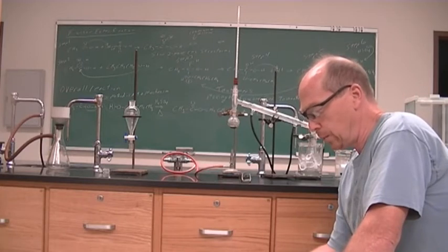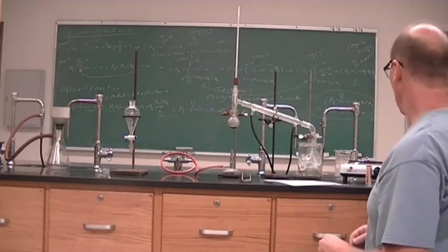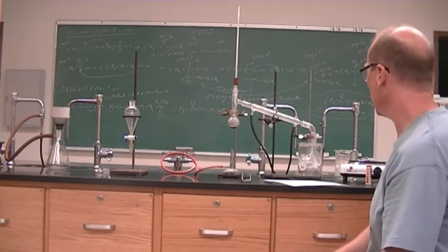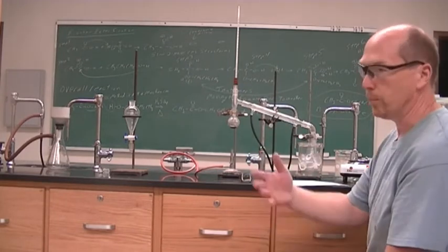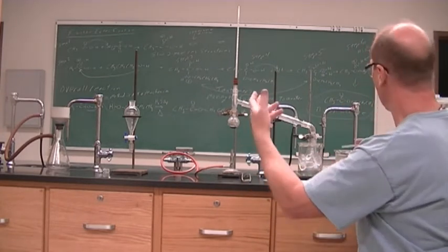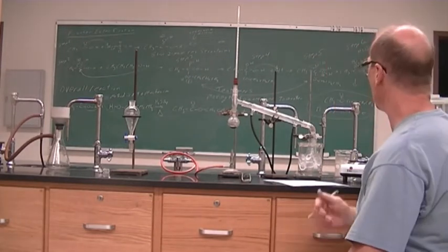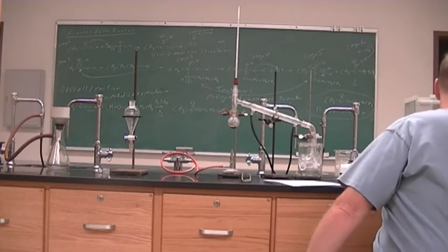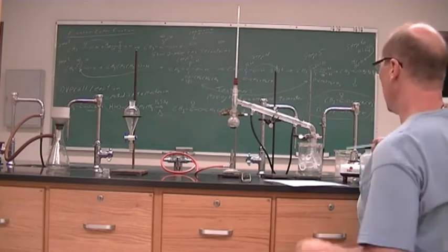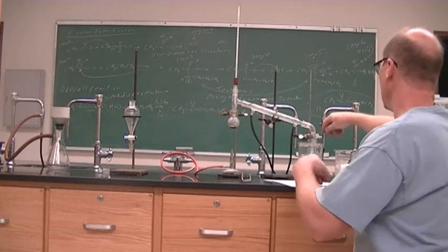So we have this in ice water. We're going to add some saturated sodium carbonate, and so we are going to neutralize the acid. We know that there was sulfuric acid as a reactant. It was a catalyst actually, but we added it. Catalysts are added, so we added an acid, and there was nothing that was supposed to happen to that acid. We should still have the acid, so we need to neutralize it. And so we're going to add saturated sodium carbonate, and we should see some bubbling, release of CO2 gas.